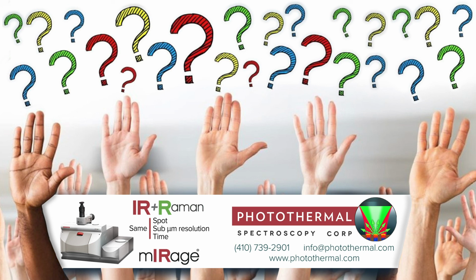Maybe we'll make this the last one. This one's for you, Christoph, I think. What do you see as the advantages of measuring cells in water rather than fixed and dehydrated? And they say that it would be interesting to compare classification of cells in water versus dry.